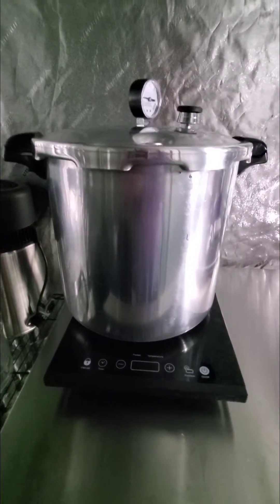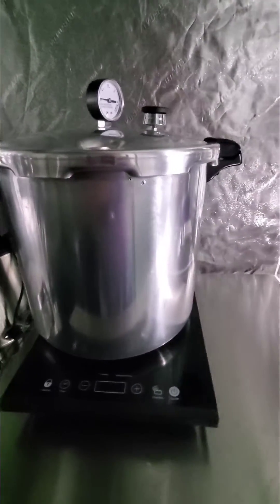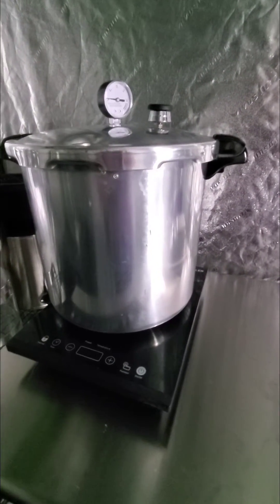My pressure cooker and induction plates. This is an induction pressure cooker I use for sterilization and media making on my induction plates.